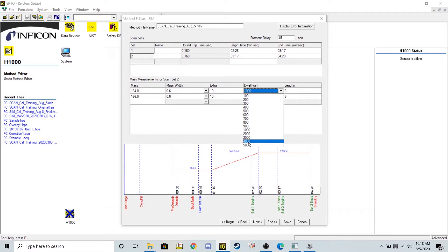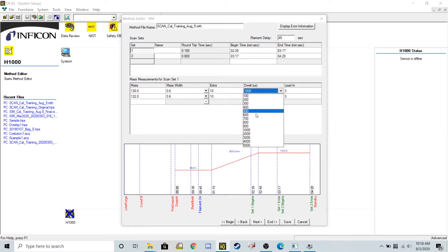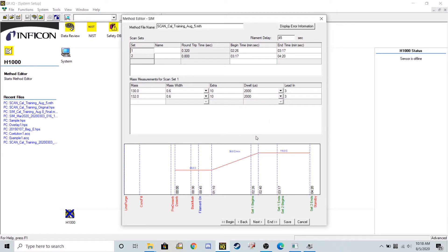I'm going to up this dwell time, since we're only looking for a couple ions, to as high as possible. So I'm placing it at 5,000. For the other set, we can probably put that on 2,000. There won't be any issues there.